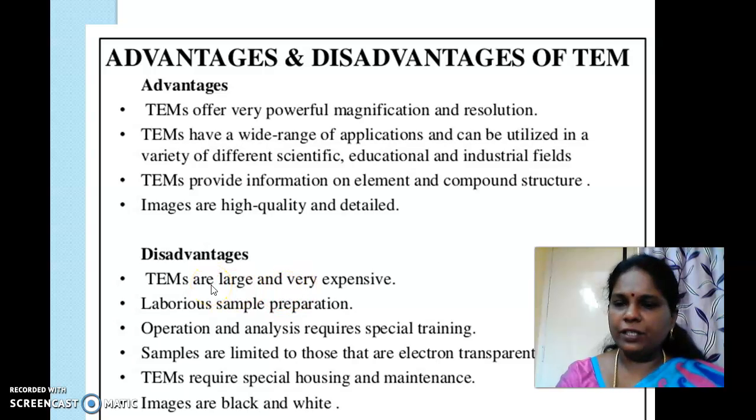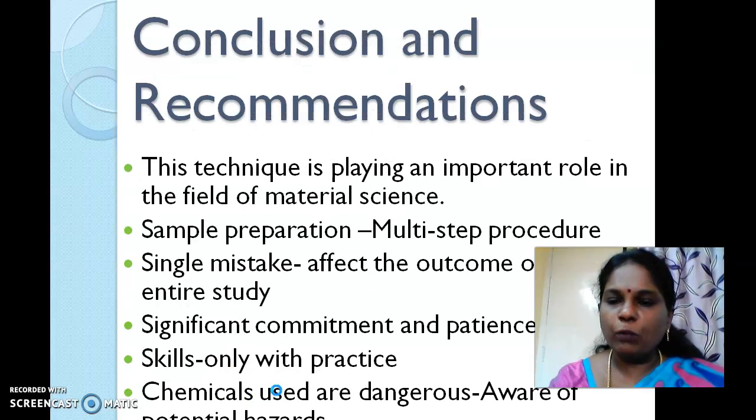It is very large. TEM occupies a very huge room. In our Madurai Kamaraj University Instrumentation Center, we have a TEM instrument occupying a very big room, and it is very expensive. It needs maintenance, laborious sample preparation, and the images are black and white.